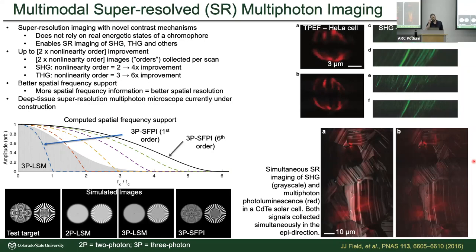Why are the limitations existing with synthetic materials versus biological? Okay. So the question is about 3D printed structures, these 3D printed scaffolds, and what the limitation is. So why might you get signal versus not? It depends on what the signal is. So if we're thinking about something like harmonic generation, it really is the structural orientation.